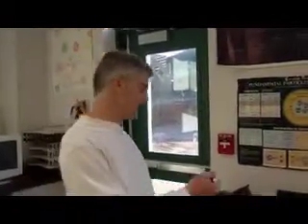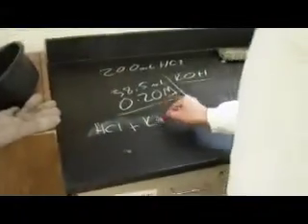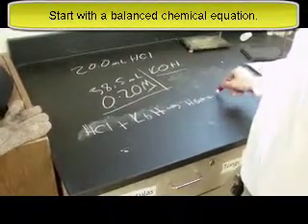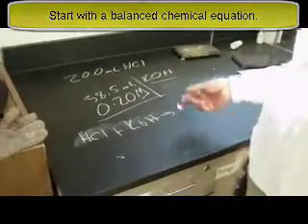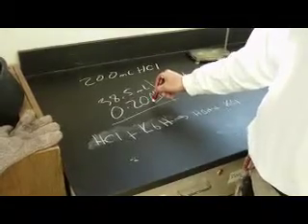Okay, now let's do the math. So it's all about the math, isn't it? The chemicals that I mixed together, if you recall, here's the table. I had HCl, and I reacted with KOH, and that's going to make water, HOH, plus KCl. That's the balanced equation. It's a 1:1:1 ratio. Now, if you recall, we had 38.5 milliliters of 0.2 molar potassium hydroxide.